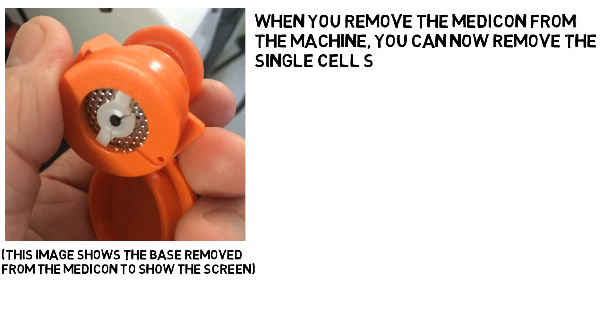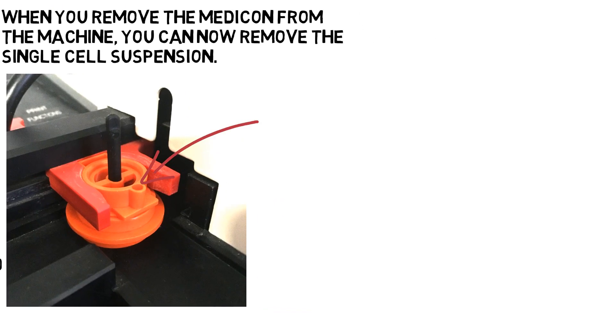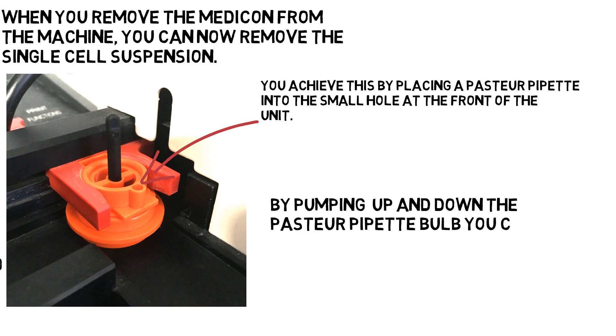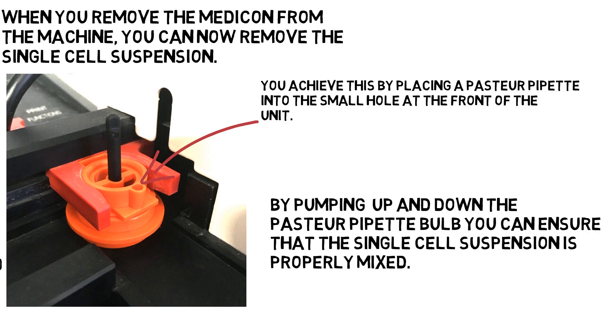You access this volume of cells via a small hole in the top of the unit. To do this, remove the lid of the Medicon and place a Pasteur pipette into the hole at the front. Gently pump the Pasteur pipette up and down to collect the suspended cells, placing them into a test tube.